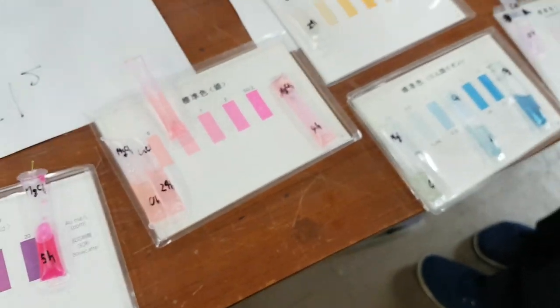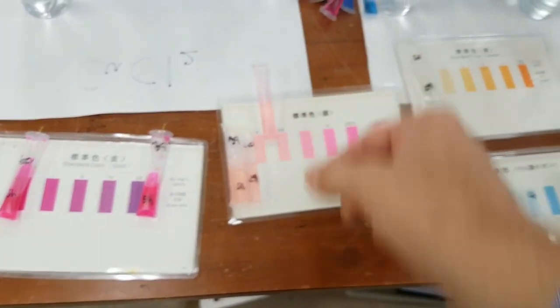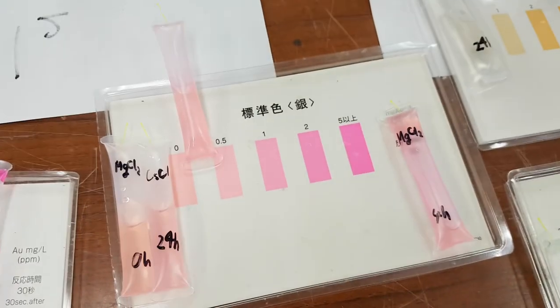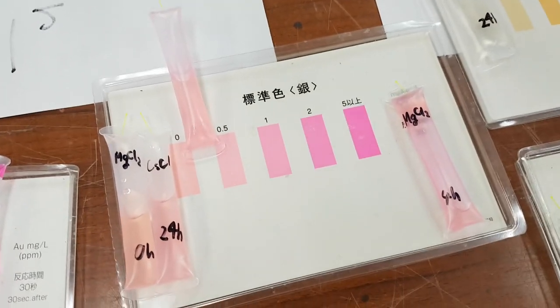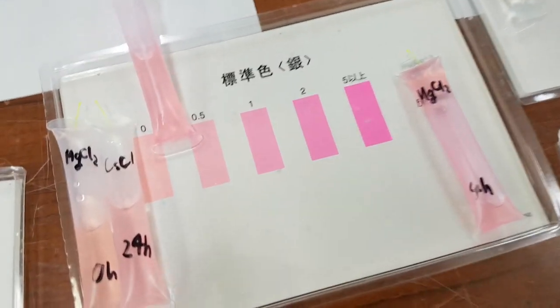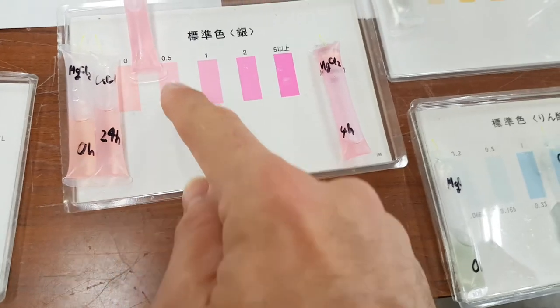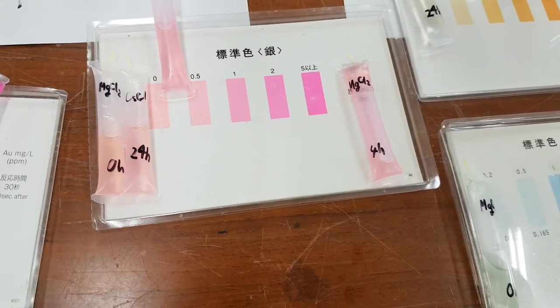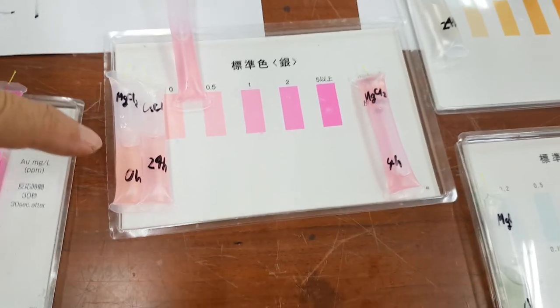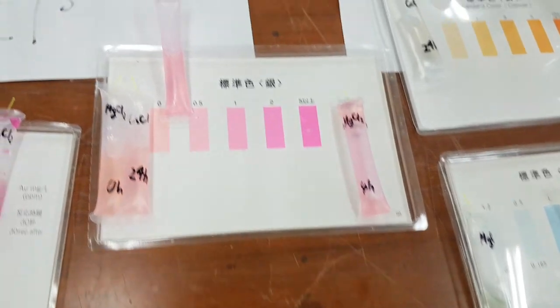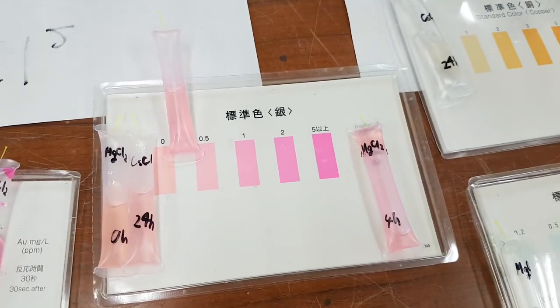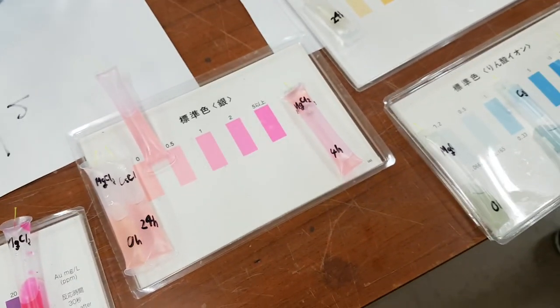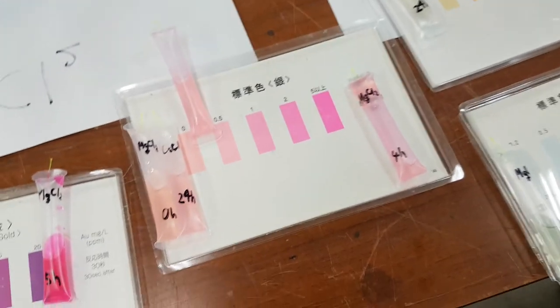What would you say, George? Would you say there's a null or? It's pretty close to a null, I'd say. On this camera, it looks like a null. It's slightly darker. It's definitely darker than that one. I think you might have an interesting result here.